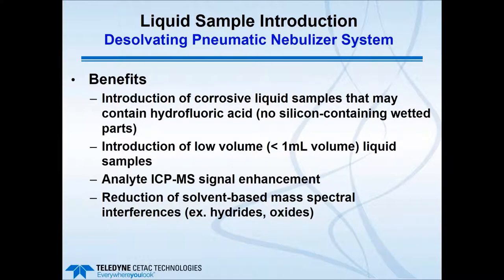Now, some of the benefits we're looking to get out of this type of a system of combining these three components is first the introduction of very corrosive liquid samples that may contain hydrofluoric acid, meaning that we cannot have any silicon containing wetted parts such as glass nebulizers or glass spray chambers. And this is particularly important in geological samples that may contain silicon or in semiconductor samples.